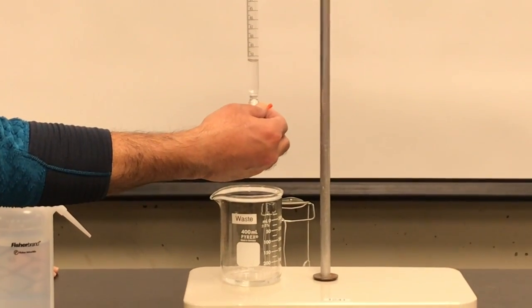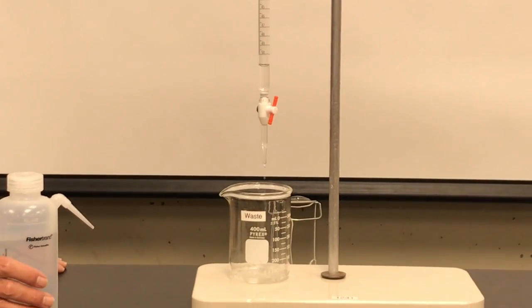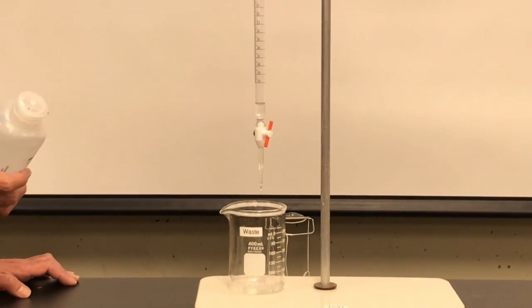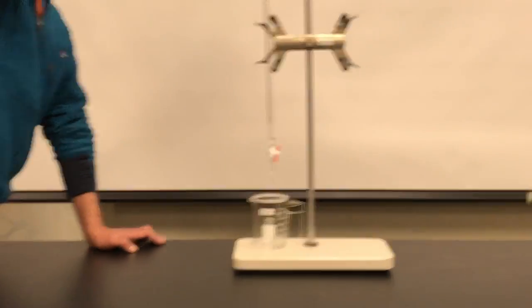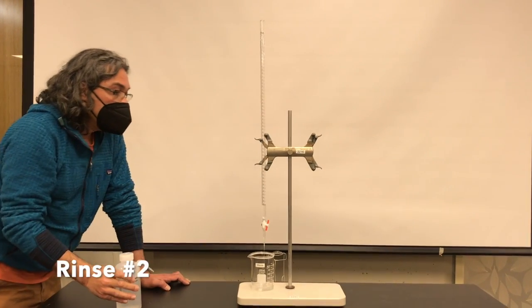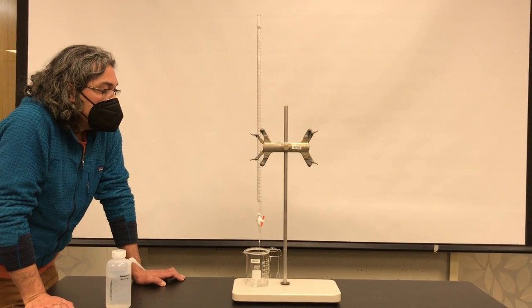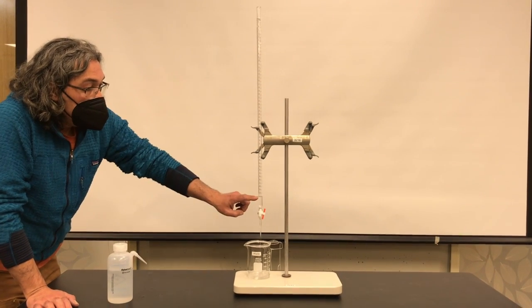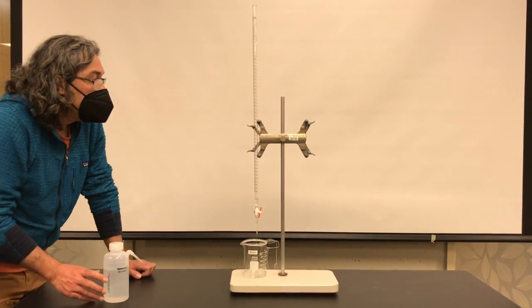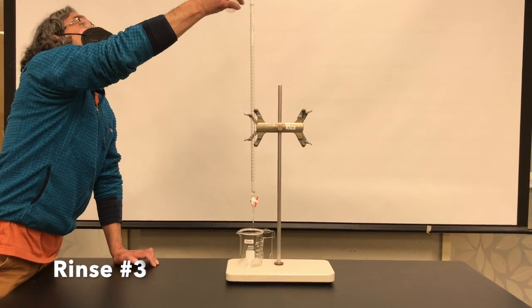I'm going to finish doing the next 2 rinses. So I'm actually just going to open the flow about halfway, and I'm going to wait till the water gets close to the valve. And before it goes dry, I'm going to go ahead and add a little bit more water to the burette. This will be rinse number 2. Again, I'm just watching the water go down on the burette, and before it reaches the valve, I'm going to add more.